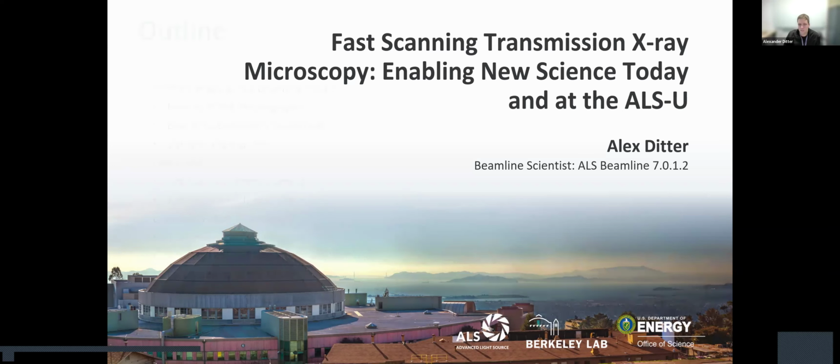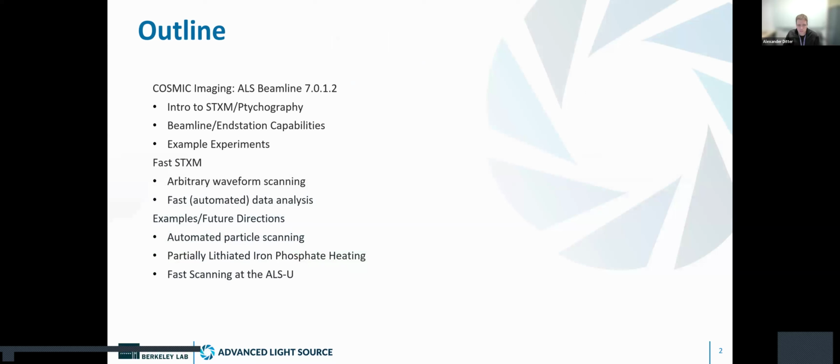All right, thank you. So what I'm going to be talking about today is I'll give a brief intro to our beamline, which is a STXM and ptychography beamline. So I'll explain how those work. I'll talk about the beamline itself and show some experiments to give you an idea of the kind of science that goes on there. And then I'll talk about some of these upgrades we've been doing recently for fast scanning transmission X-ray microscopy. And I've shoehorned in a data analysis project here as well.